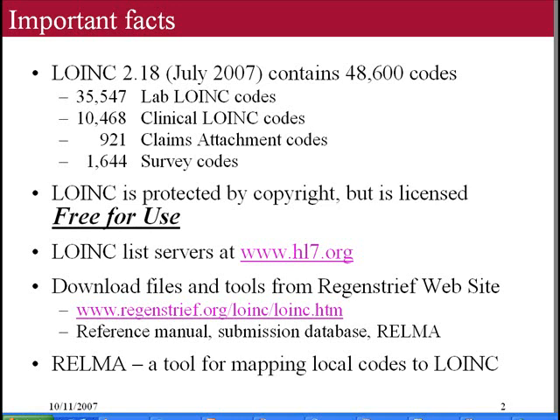There is RELMA, which is the Regenstrief LOINC Mapping Assistant that we'll do a demo of a little later, but it's a browser and mapping tool that you can use to investigate and browse the LOINC terminology.